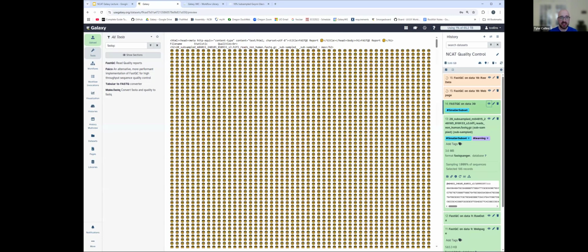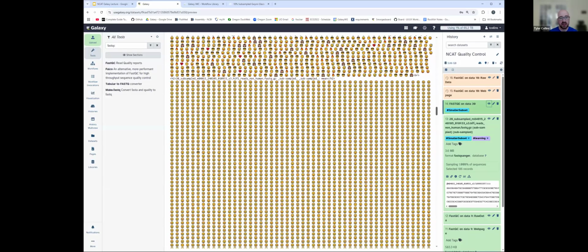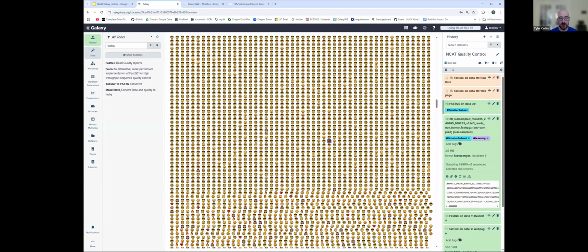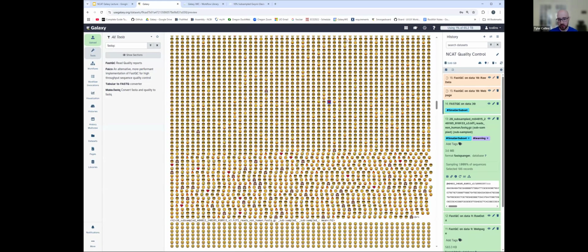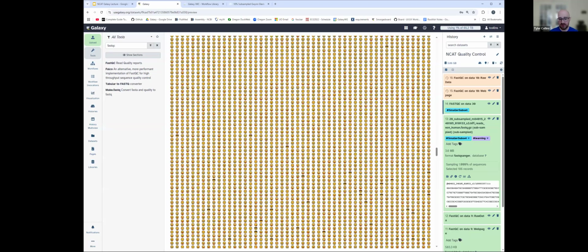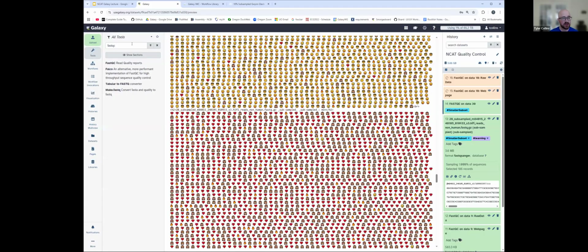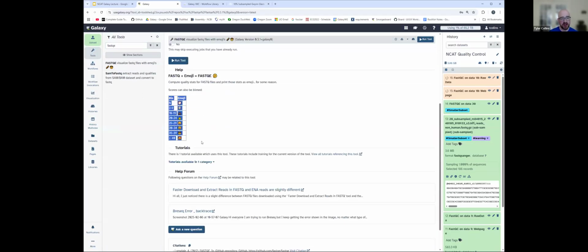And rather than those beautiful graphics, this is a program that somebody wrote that analyzes each individual base in your reads based on emoji. So depending on how happy the emoji looks, it scores it based on how good your read was. So you can see in our case, in this blinding yellow array of never-ending emojis, we have lots of very happy ones, with one quality score here of a broken heart that's really bad. And you can see as we look across our reads, they'll tend to get a little worse as it goes on here at the end. But overall, for the most part, very high levels of reads. In terms of the metric of what you want to see, they have their scoring methodology here.